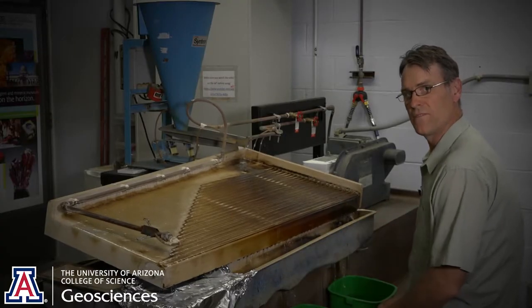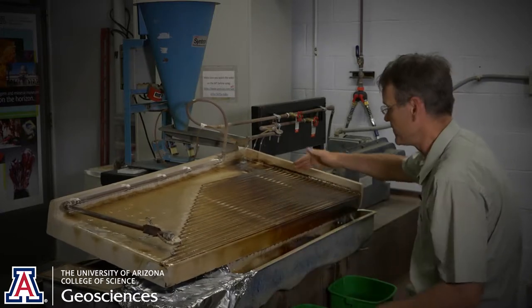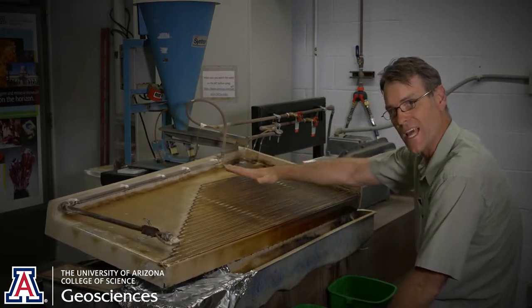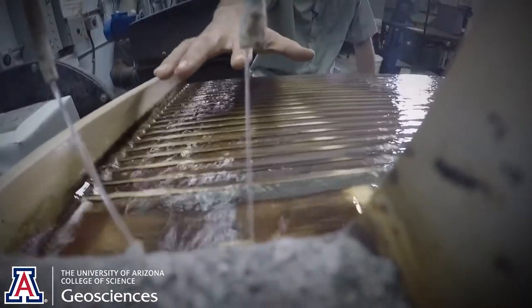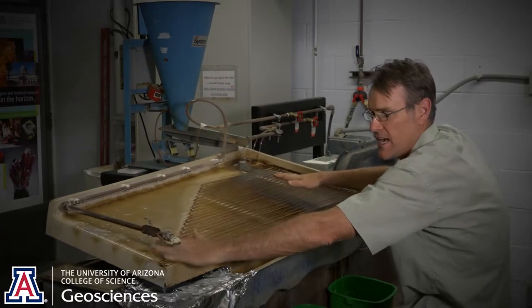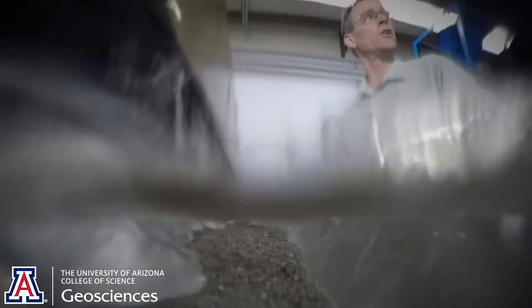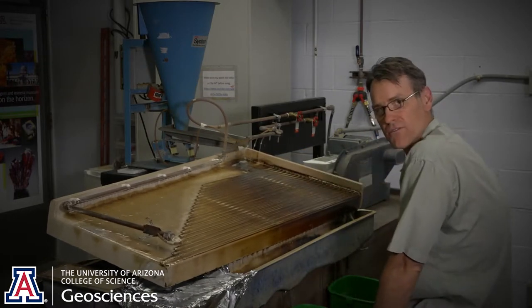The last step is the Wilfley table — it's essentially just your gold pan rolled out flat, with the same grooves going slightly uphill. We're now pouring our sandy sample, and our heavies will track their way uphill and make their way all the way down here into our foil boat. Everything else lighter will typically come straight off the water table.